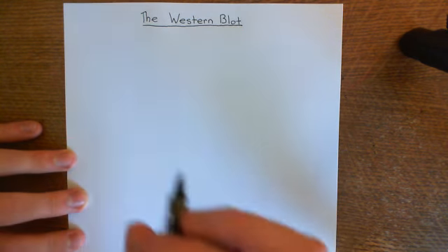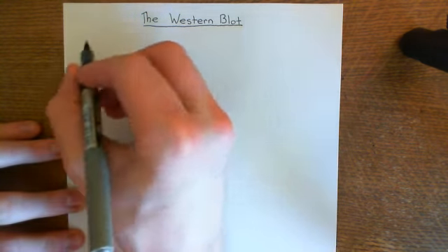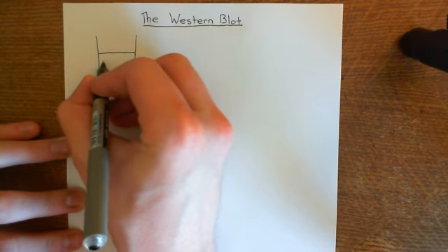So let's start off then with the motivation for the Western blot. Basically, if you have a mixture containing many different proteins, let's say we have some container here, some beaker, which contains some fluid that contains a whole mixture of different proteins.